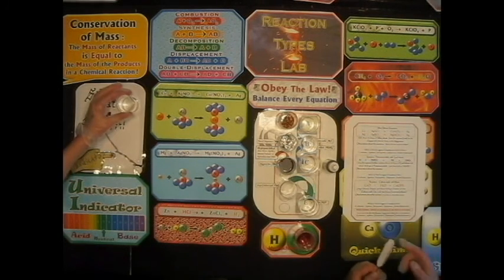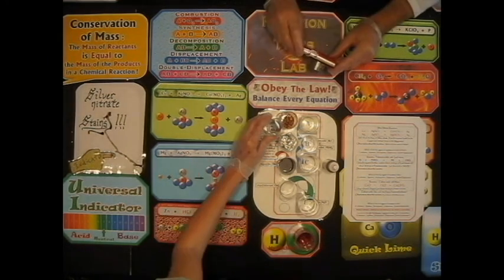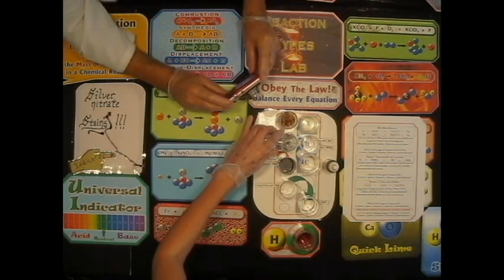So let's get a temperature. Yeah, that's probably the temperature in this room. What is it right now? 23.3. Okay, we'll say that's the temperature before. Okay, now Giovanna, I'm going to get a good shot here. Giovanna's going to pour into the copper. And she's just going to go ahead and pour the rest into the magnesium.